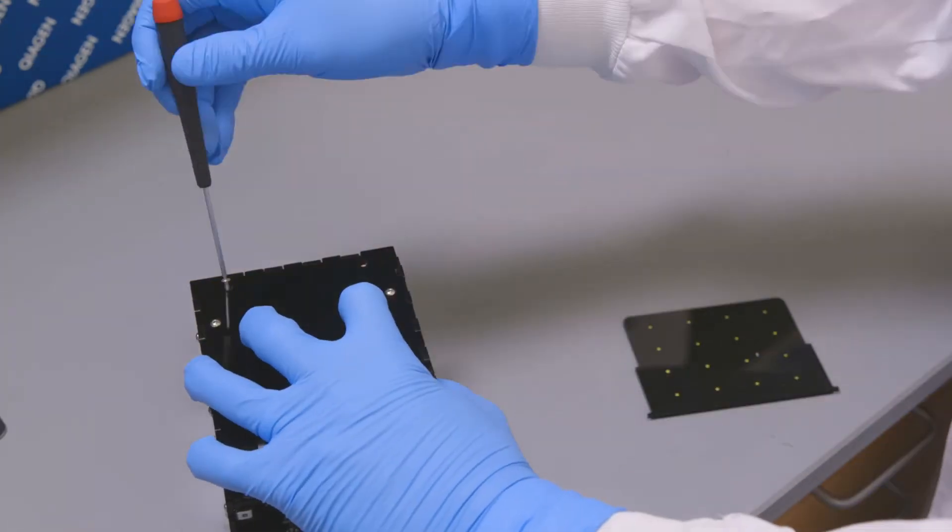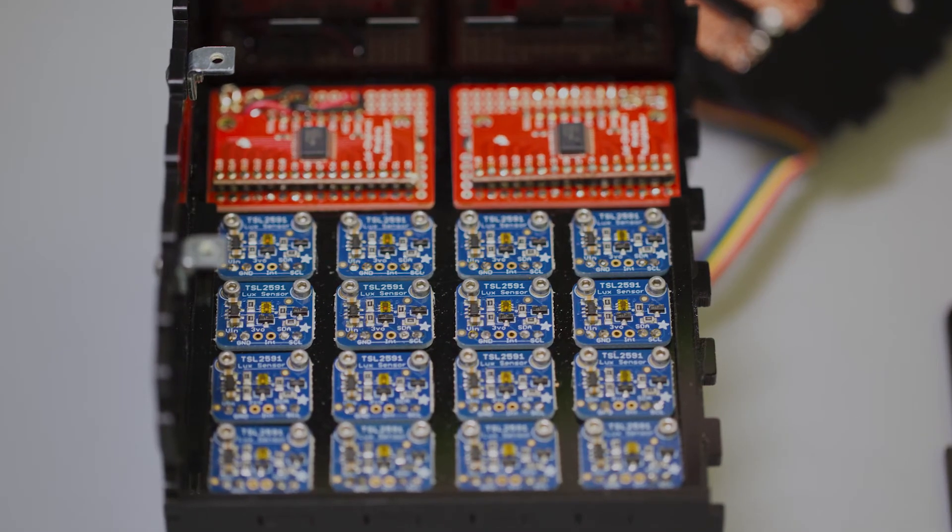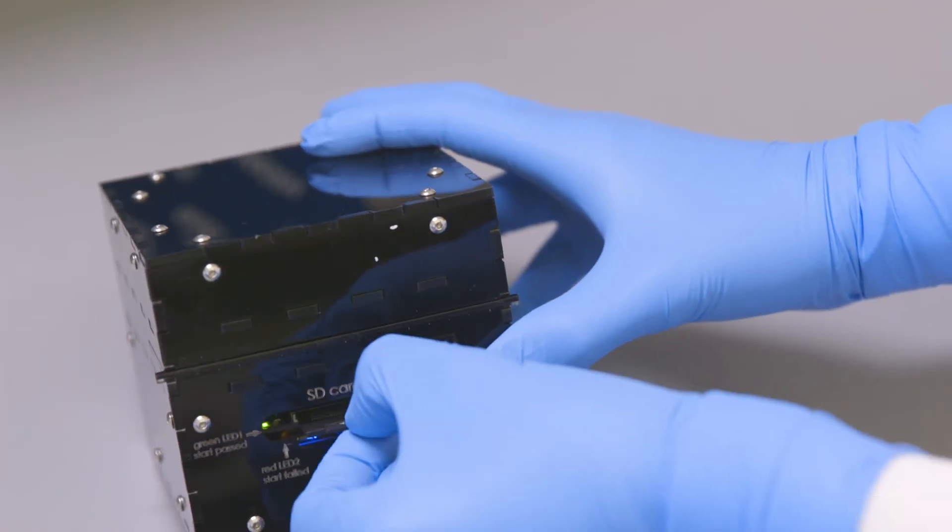Next is the electronic sensor layer, which reads the transmission of light through the paper discs. At each time point, data from the sensors is recorded on an SD card.